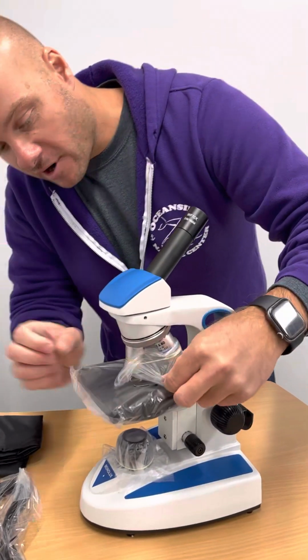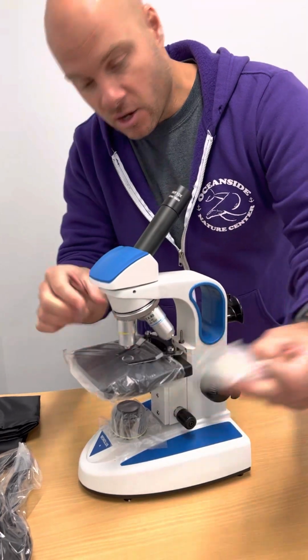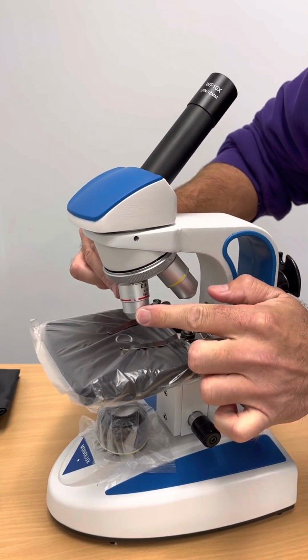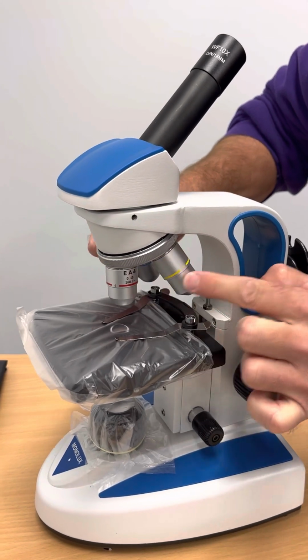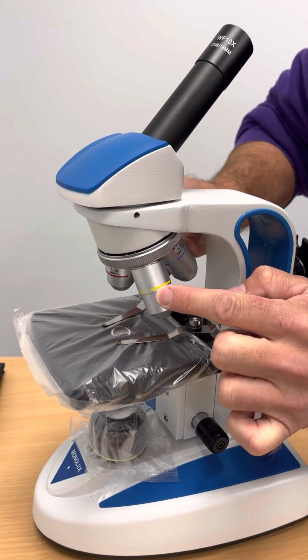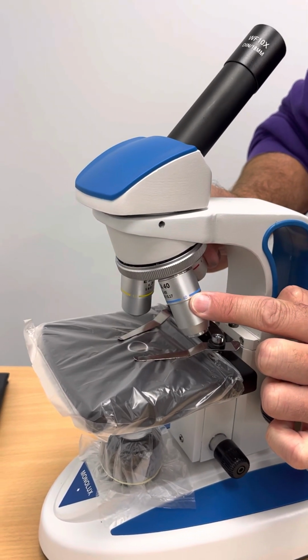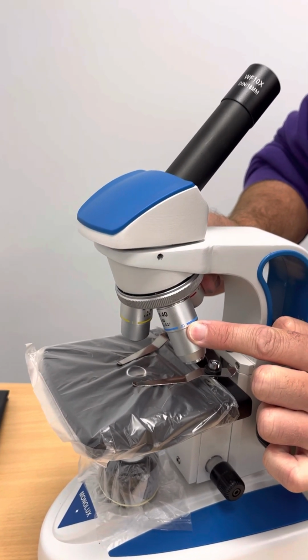Down here we have our objective lenses. 1, 2, 3 with 3 different magnifications. We have the scanning with 4x, 4 times bigger than real life. We have the low power with 10x and the high power with 40x.